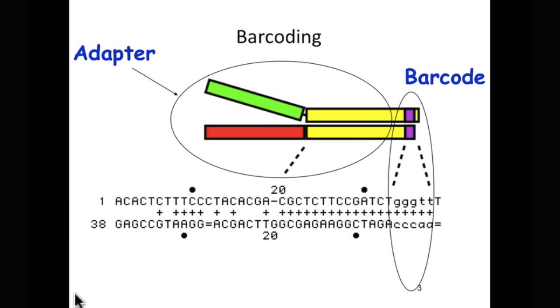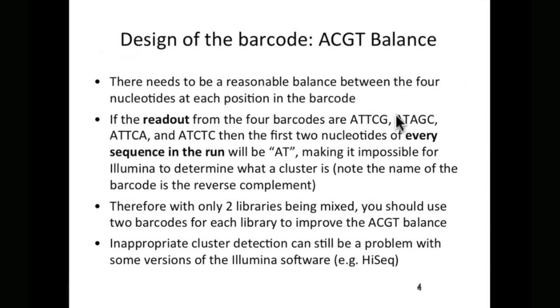But just as a quick review, here is the Illumina Y adapter, and here's the barcode. This is the sequence that you're going to add to the adapters to uniquely identify a particular pool of sample. So, there are a few considerations when designing barcodes.